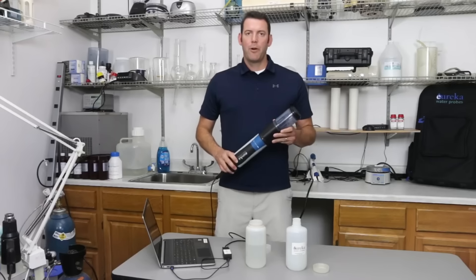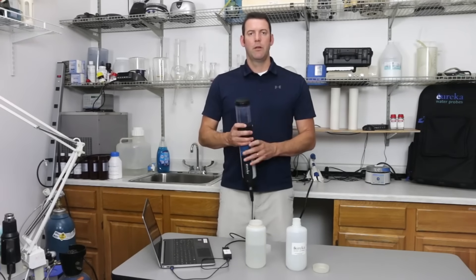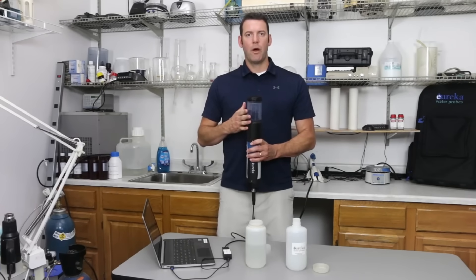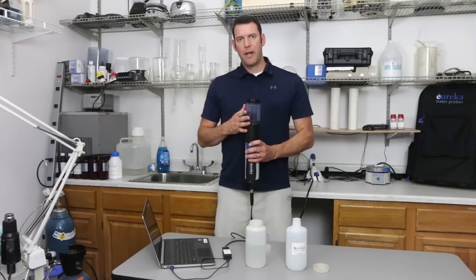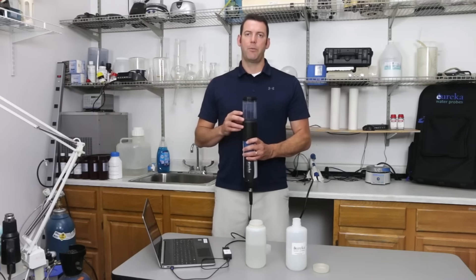Now we are going to do our rinsing process. To do that, we want to remove the lid, do two rinses with DI water, two rinses with the calibration solution, and then fill the cup at least one inch over the top of your turbidity sensor.